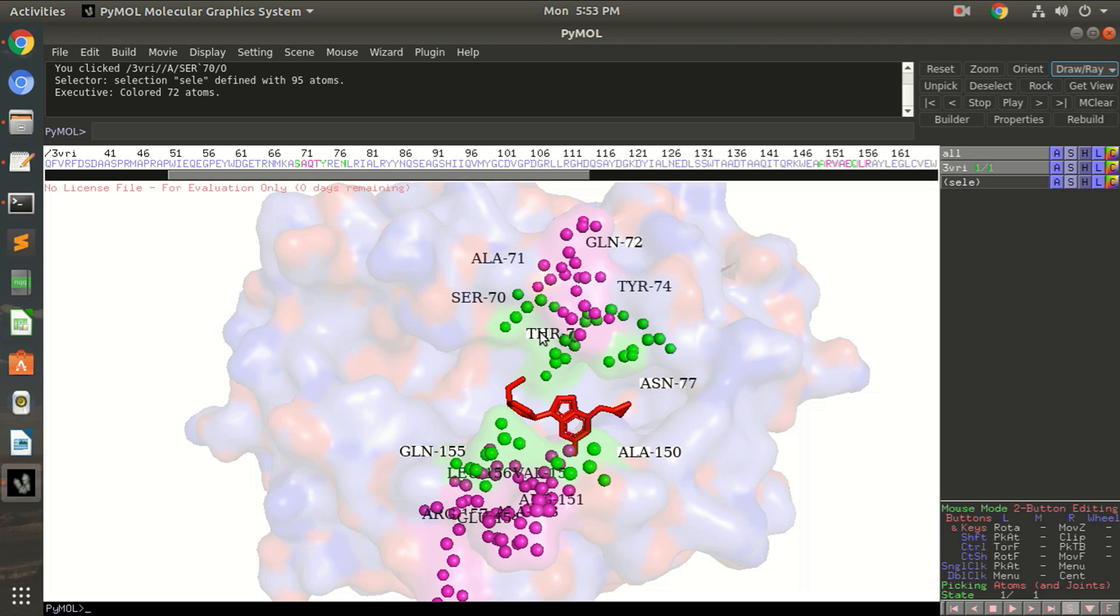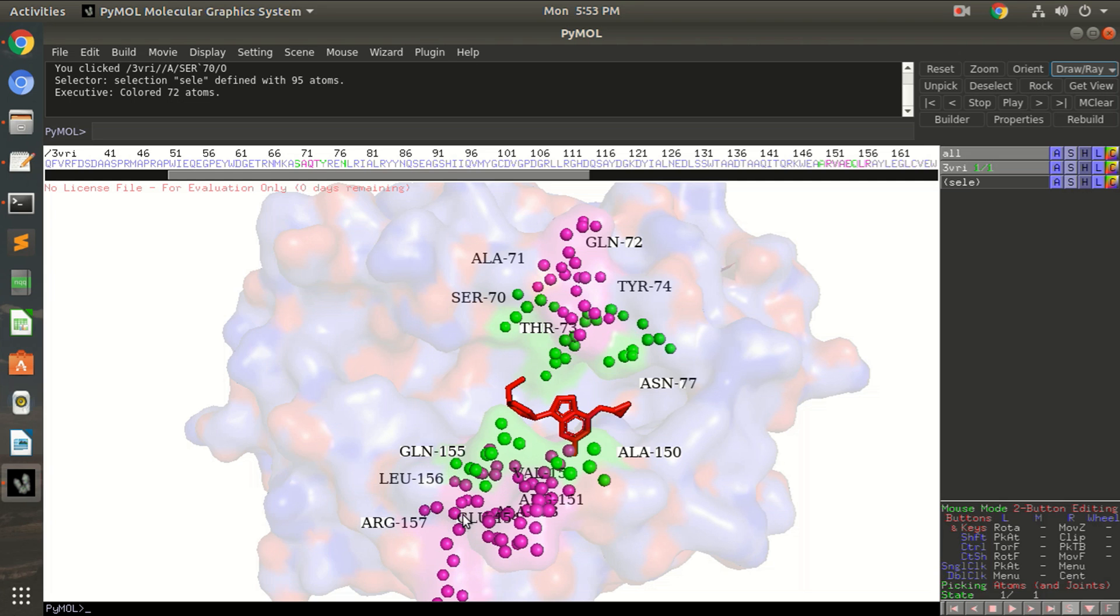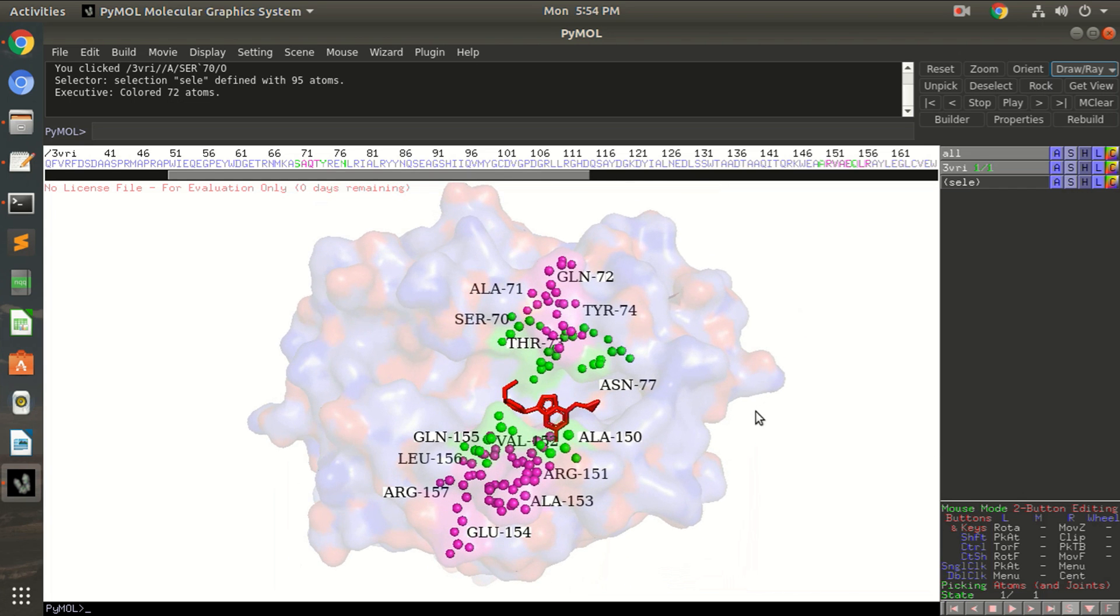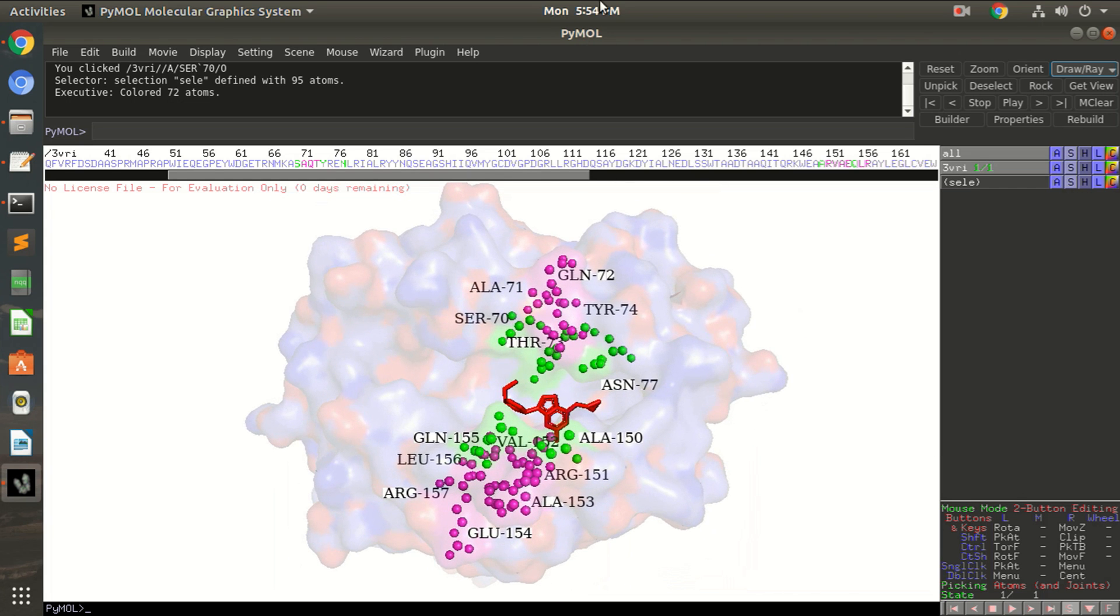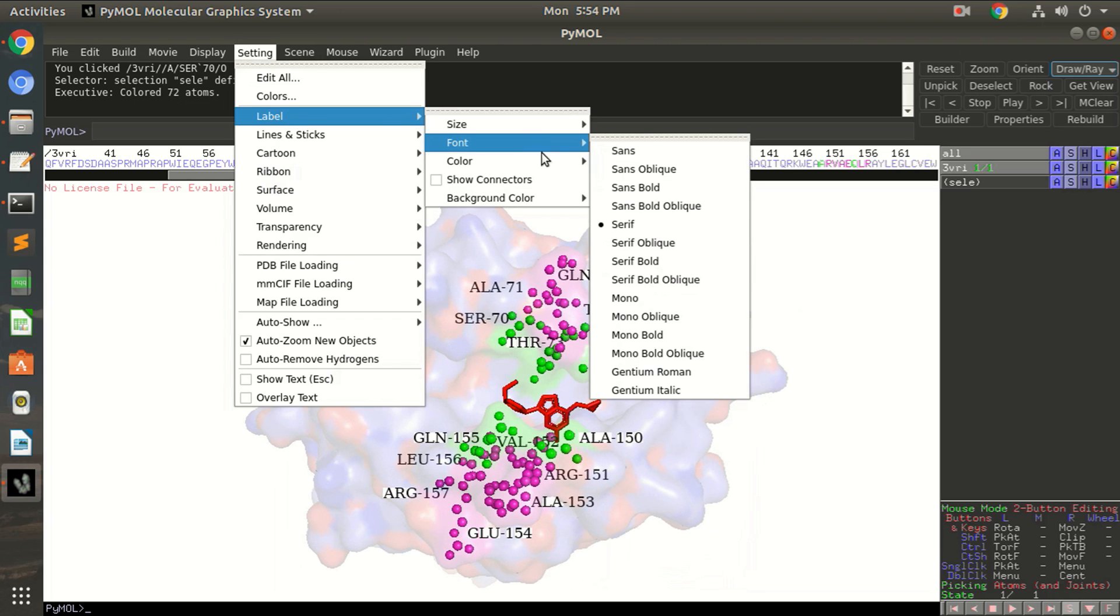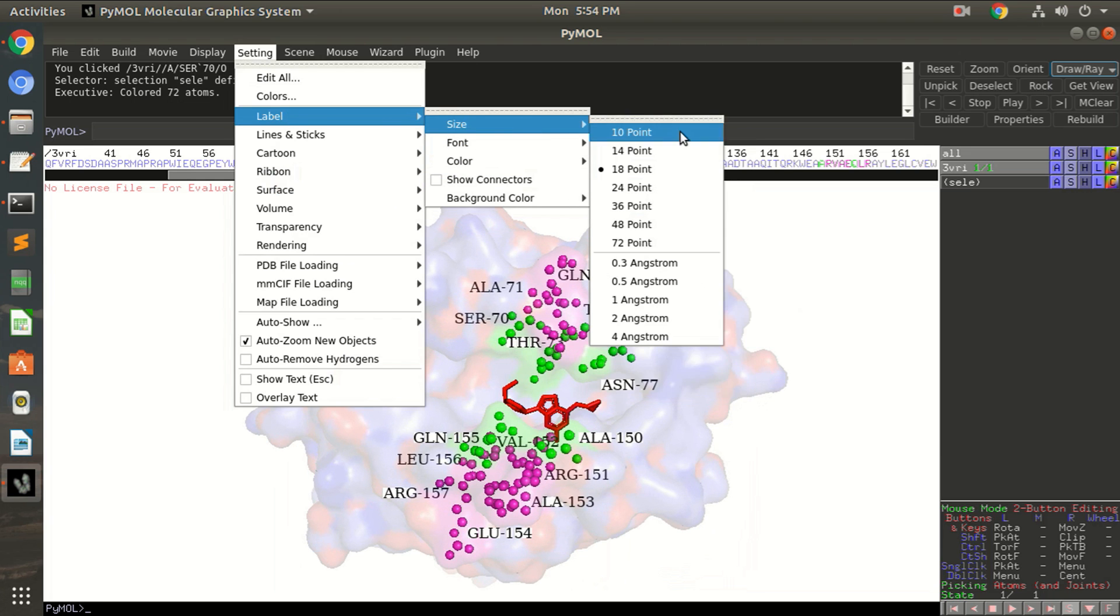Be careful while you are clicking on the label name, otherwise it can take away the part of protein with it. So make sure you are keeping them close to their real residue name. Okay, now you can decrease the size of your font.